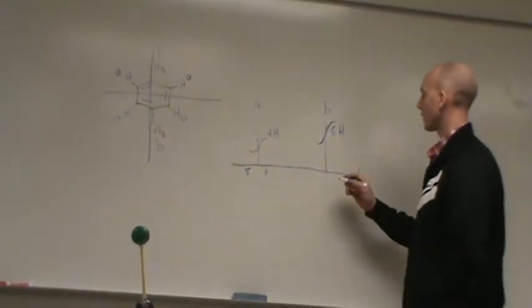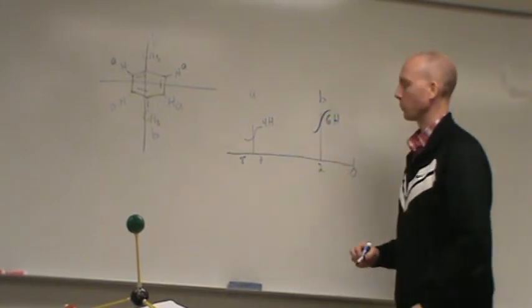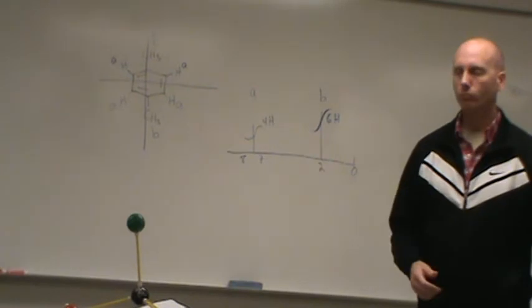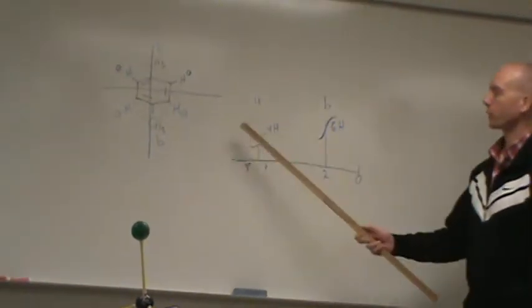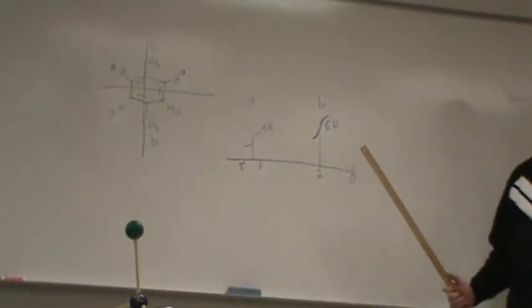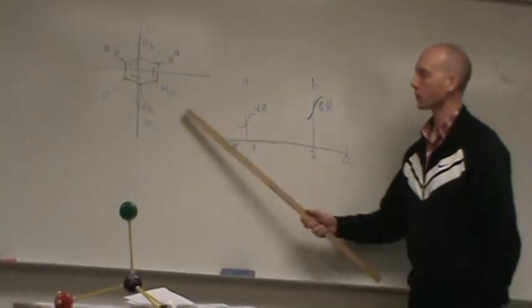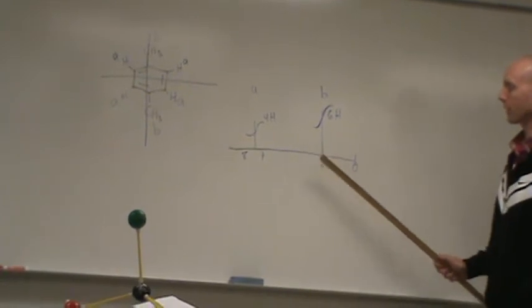Okay, this singlet here is probably showing up at around 2. Okay, as you've been reading, CH3s by themselves with no deshielders usually show up at 1 or less. As soon as you start putting a deshielder next to CH3s, they start going higher downfield from 1.